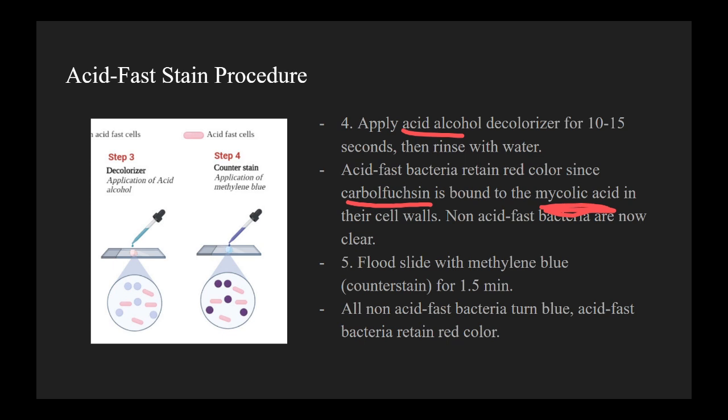So in this step, the non-acid-fast guys are just going to get their primary stain washed out of them. So these guys are clear here. Yeah, so as you can see, we have the red that are acid-fast, and then we have these clear cells that are not acid-fast.